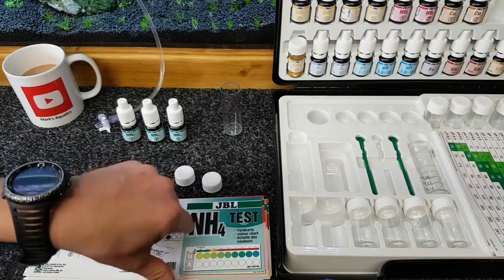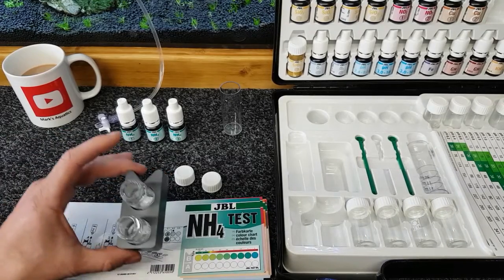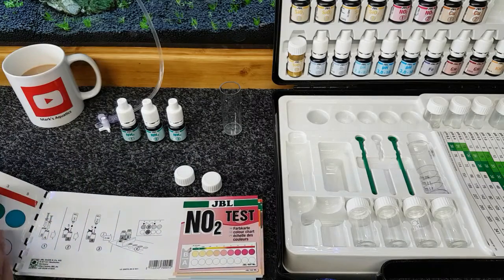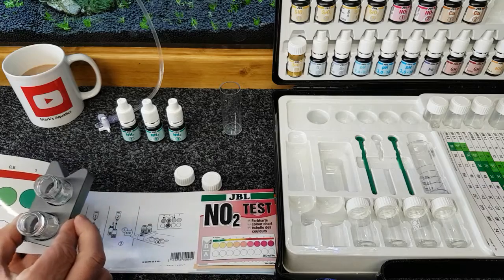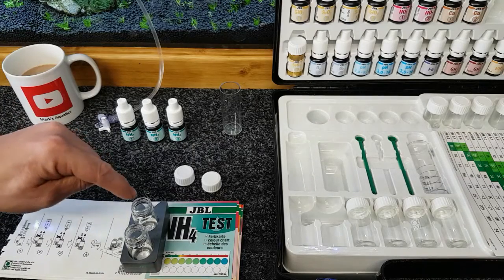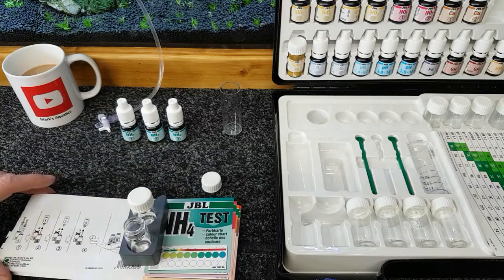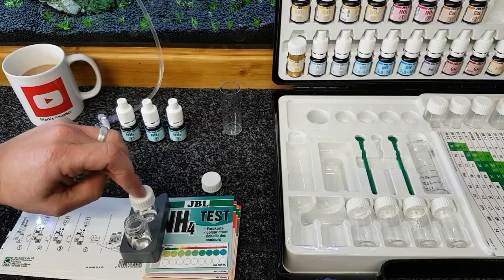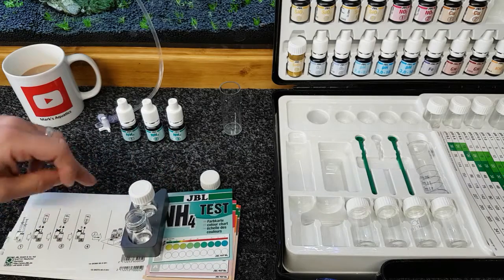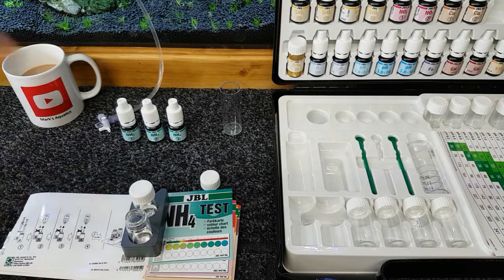Now what we've got to do is follow our instructions. What you do is you keep the notched end open to the top. So when we turn it over, that corresponds with the line at the top. We'll go over there and I'll show you that in a minute. Right, now what we've got to do is not put any of the reagents in this first jar. So I can stick the lid on that for a moment. This is our test sample, so it's just giving us a clear light window through the liquid onto the card colour underneath. So it's giving us a more accurate look through the water onto the colour. With this one, this is the one we put the reagents in.